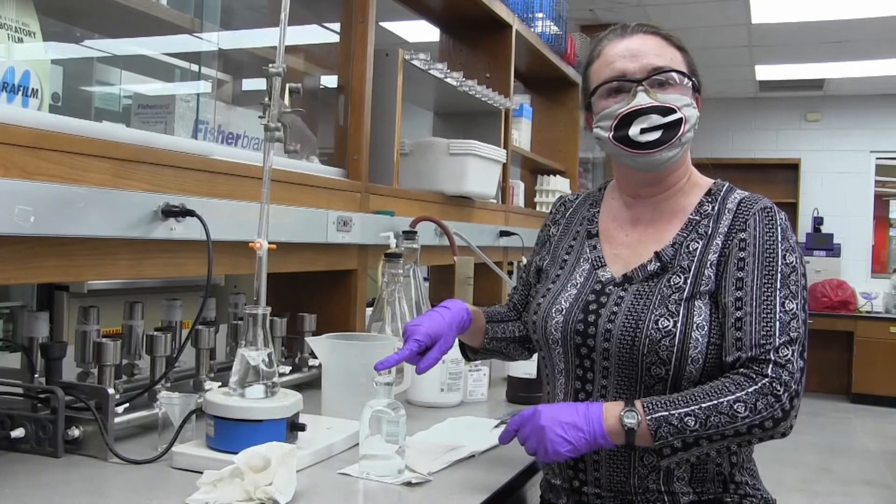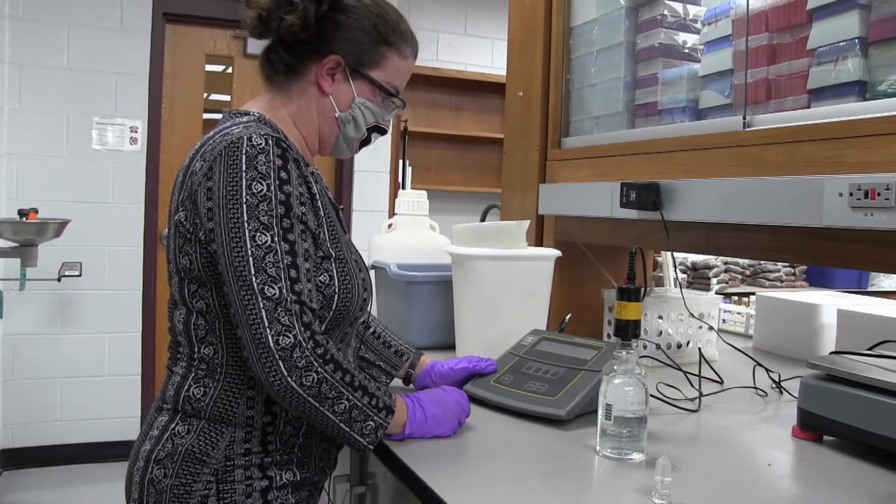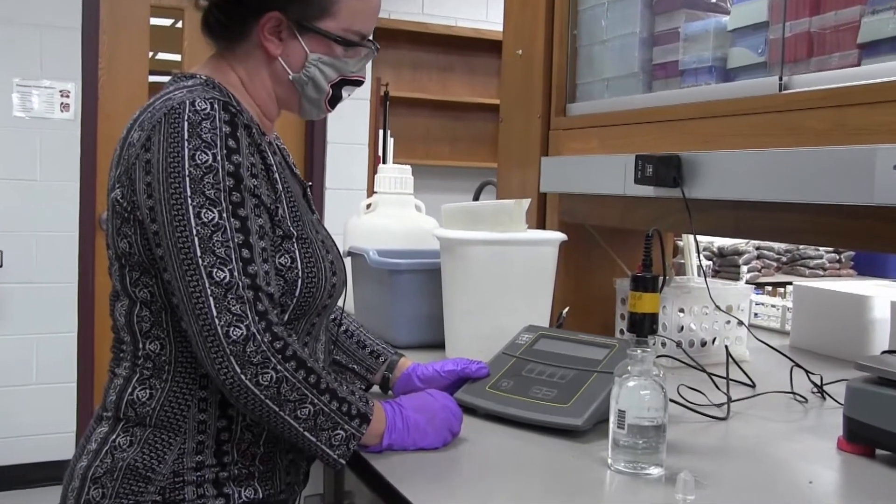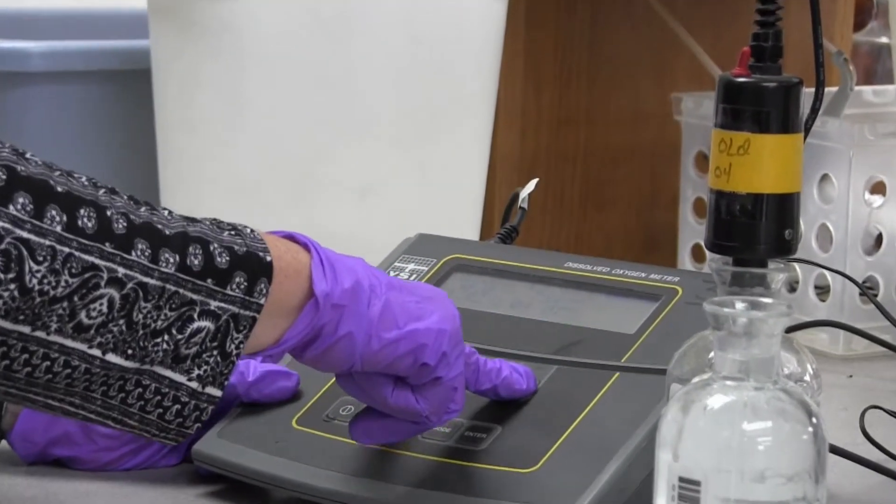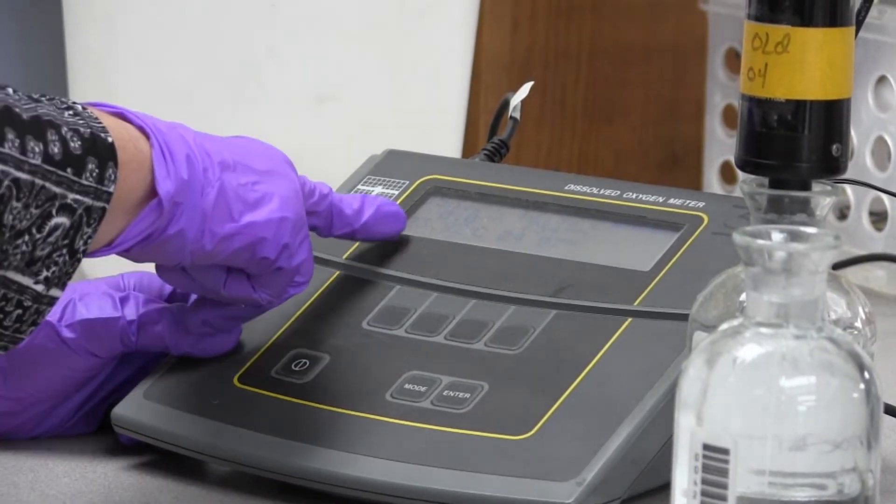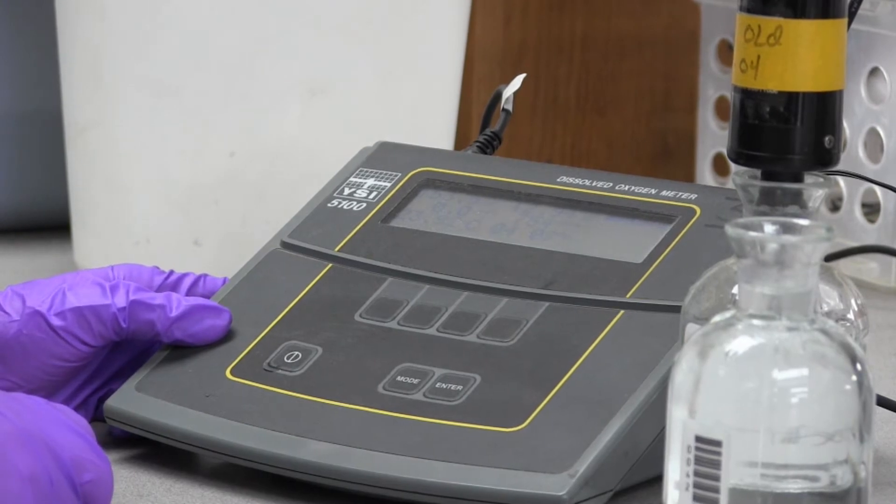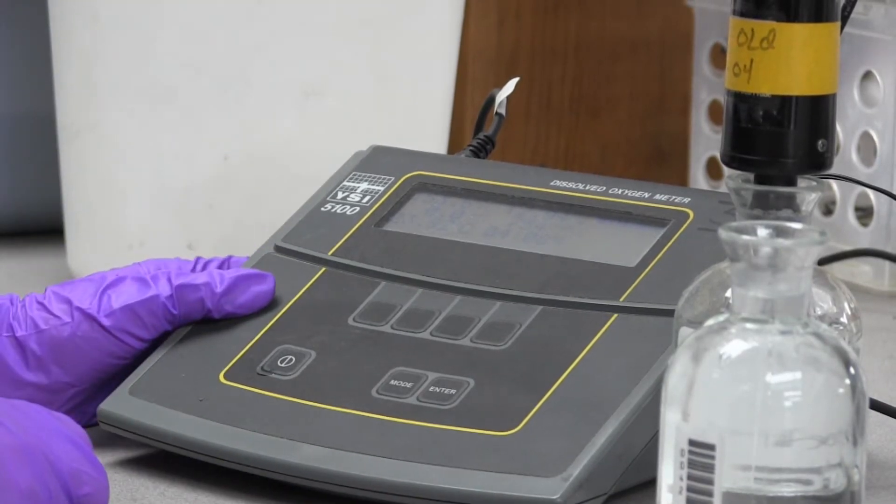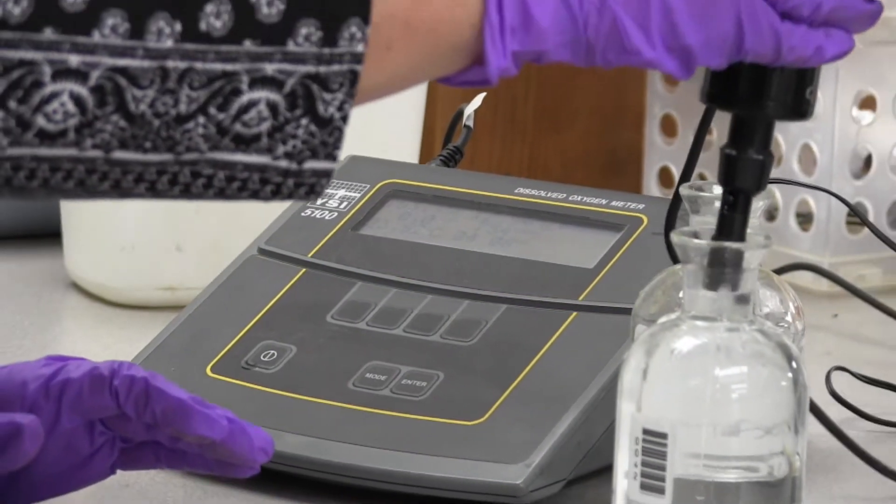I'm ready to take this one over to the DO meter. First of all, I've already turned the meter on. This is our YSI dissolved oxygen meter. I'm going to press calibrate. It does have a soft key for auto cal and you could just press that and carry on with your test. Since we did the Winkler method, we're going to manually enter that number in that we just titrated.